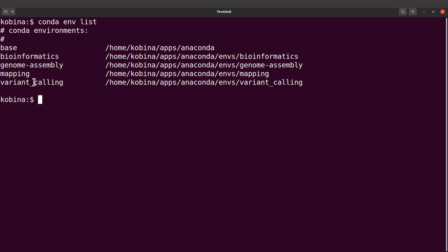We will activate it. I'll say conda activate genome-assembly. After that I can type megahit.